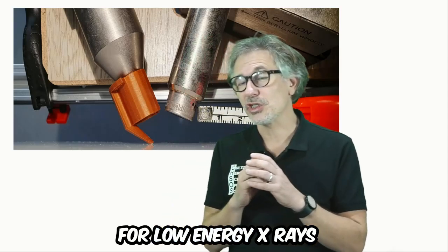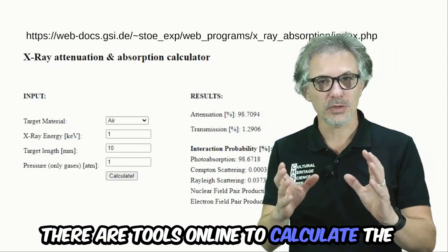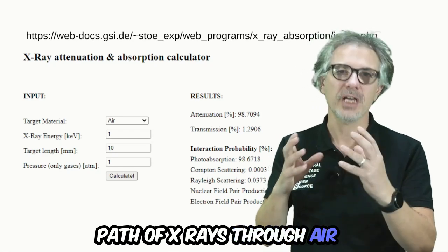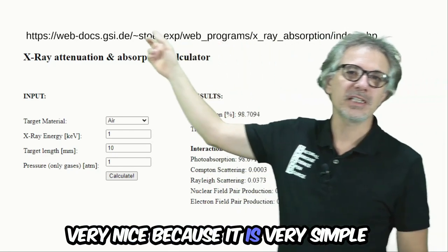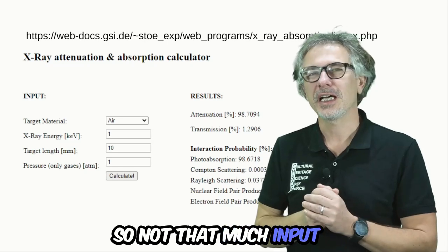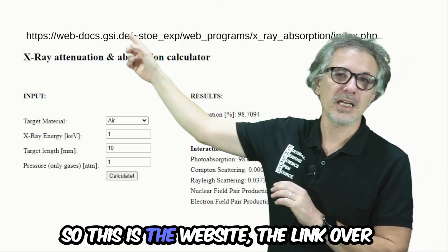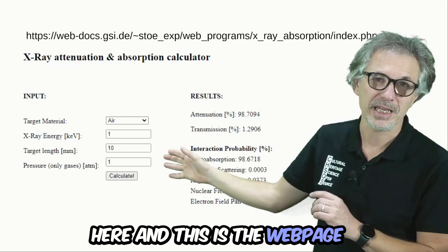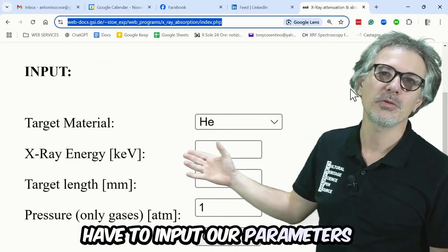Air, oxygen and nitrogen that are here can actually stop the X-rays, and this effect becomes more apparent for low energy X-rays. There are tools online to calculate the path of X-rays through air. Here I put one that is very nice because it's very simple, with not that much input to give to this tool. This is the website, the link over here, and this is the web page. This is the window where we have to input our parameters.